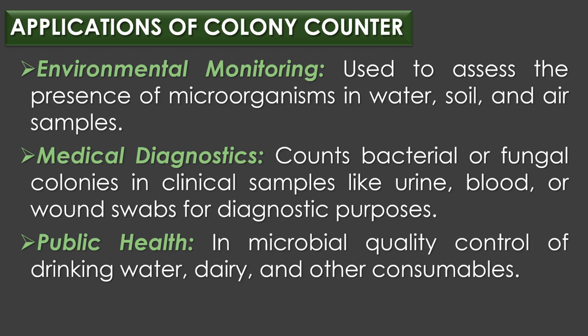In environmental monitoring, the colony counter is used to assess the presence of microorganisms in water, soil, and air samples. In medical diagnostics, the colony counters count bacterial or fungal colonies in clinical samples like urine, blood, or wound swabs for diagnostic purposes. In public health, colony counters are used in microbial quality control of drinking water, dairy, and other consumables.